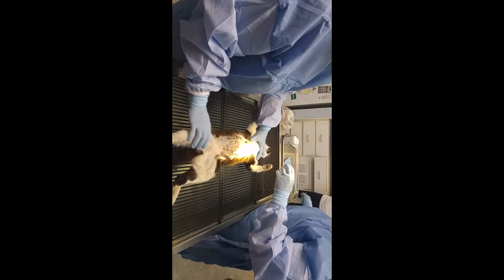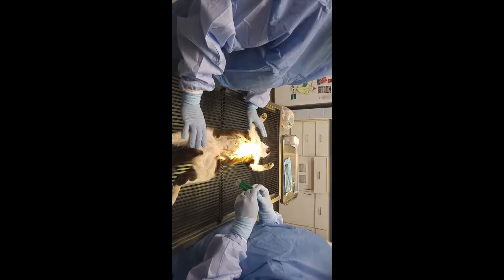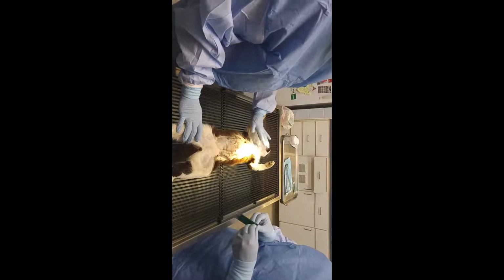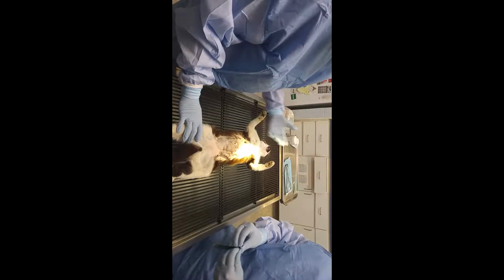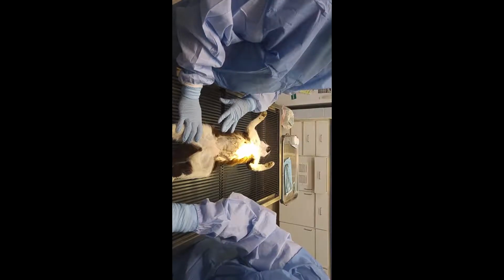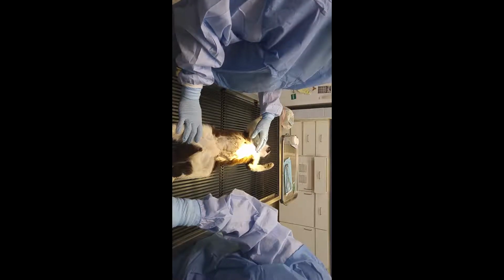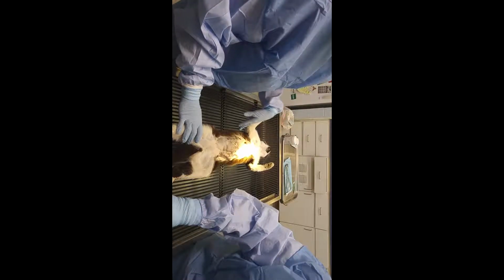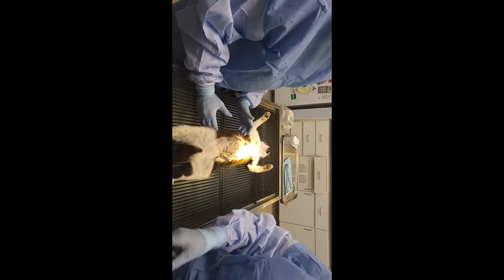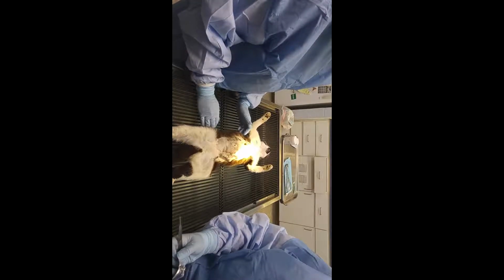With most necropsies, we tend to start in the chest cavity first. And of course, where and what we're looking for depends on the history of an animal. If this animal had presented, particularly with a cat, that the owner had just found that he or she just passed away and they don't know why, we definitely would want to start with the chest to look for heartworms, which is a very common presentation in a cat that we just find suddenly dead, or heart disease in general. So Jessica's getting me a blade together.